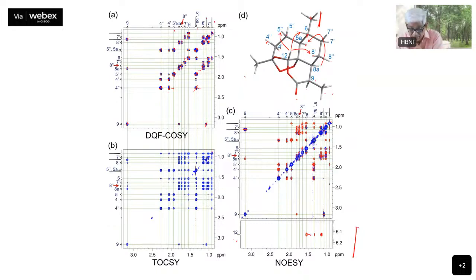There is a 6 here, and there is a 5. At 6, there is also some other proton, it looks like. 12, there is no oxygen here. Yes, 12 is this one. This is not 12. What is this here? This is 12 here at the center of the molecule. Oh, here it is 12. Okay, this is different, this is the methyl. Okay, 12 is here.